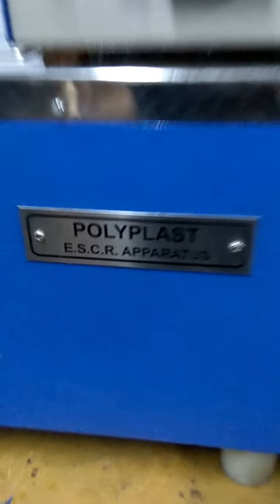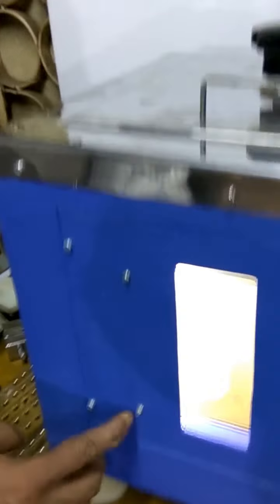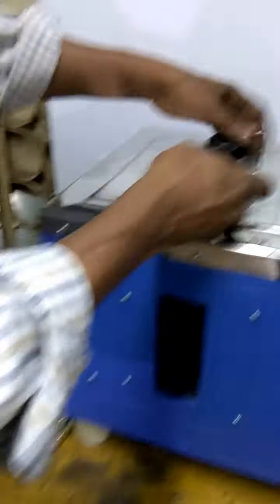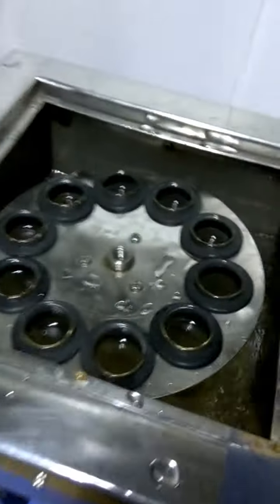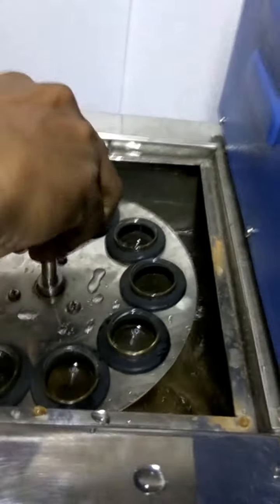Polyplast ESCR Apparatus, as per ASTM standard. It has containing test tubes — you can see the test tubes inside. Basically it has a water chamber, a water bath inside with the test tubes. There are 10 test tubes, and a stirrer is also provided.